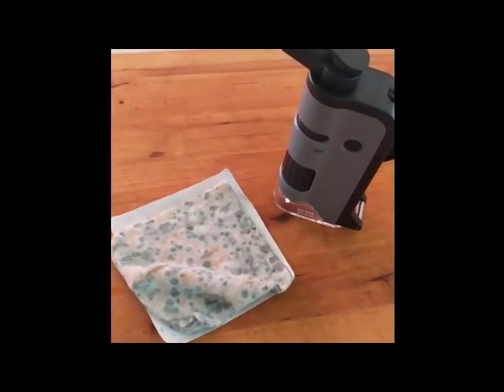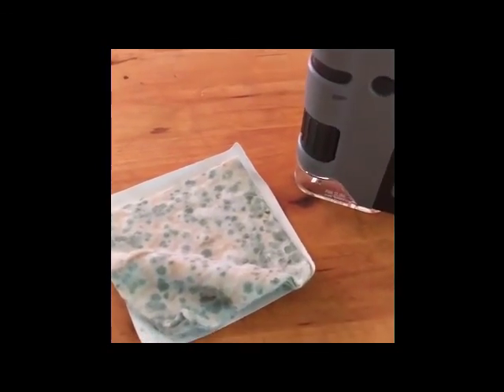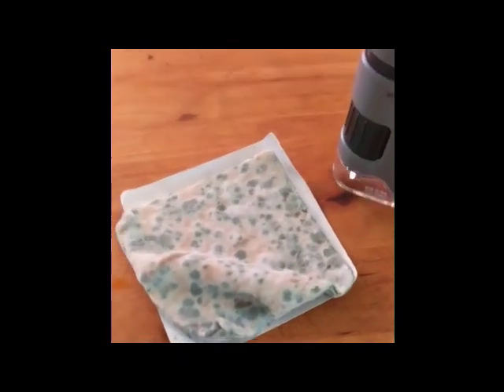For my next trick, we have this package of wonton wrappers that got left in the fridge. It's a small package and it kind of got lost in there, but it looks beautiful now. Zoomed in on the old wonton wrapper, we're seeing just nice fields of conidia spores all over them — they look like little tree branches. That is just lovely.